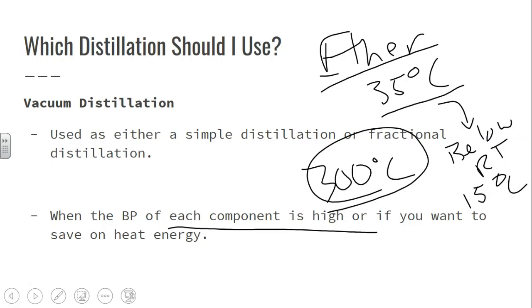Okay, so that is distillation and three of the common types of distillation, and when to use them, and some of the vocabulary that goes with distillation.